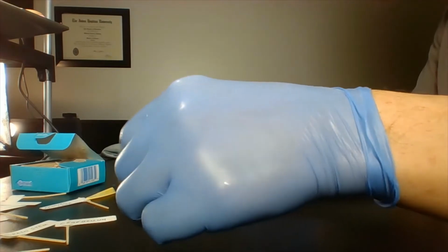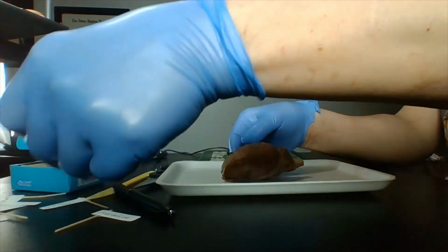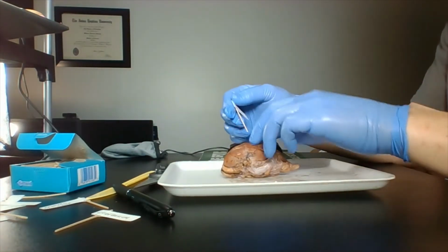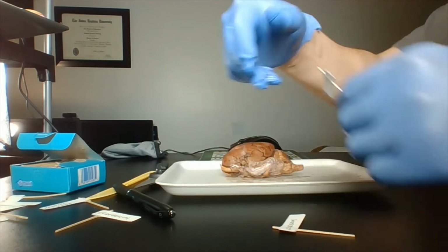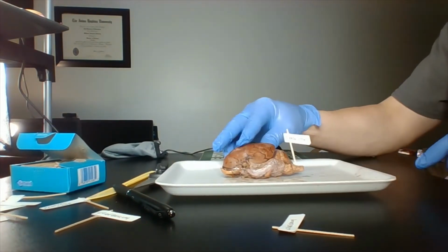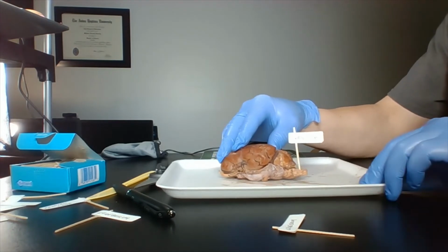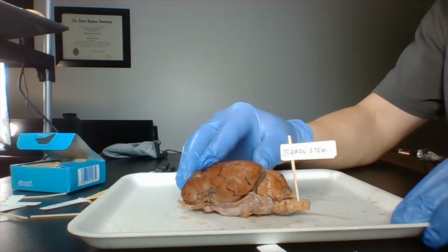So I'm going to get my little flags that you should have made. And we have the brainstem, if I can stick it in here. Let me see, if I can find it. There it is. Push right in. I know it might not work on the camera. Let me see if I put it closer to this one, and then I'll show it to the other one too.